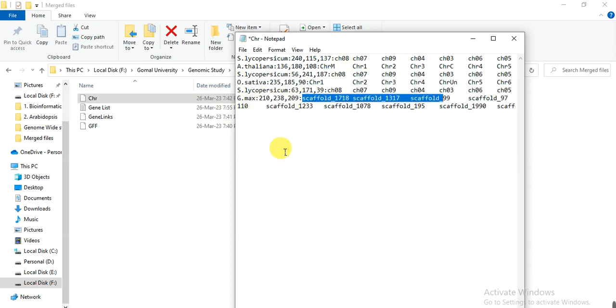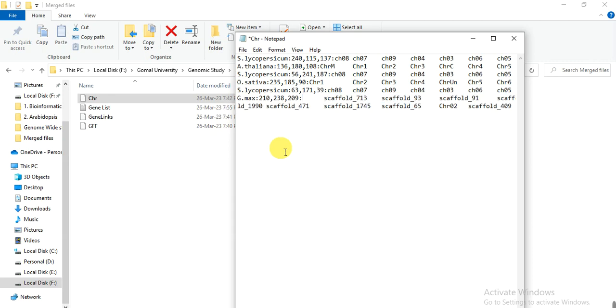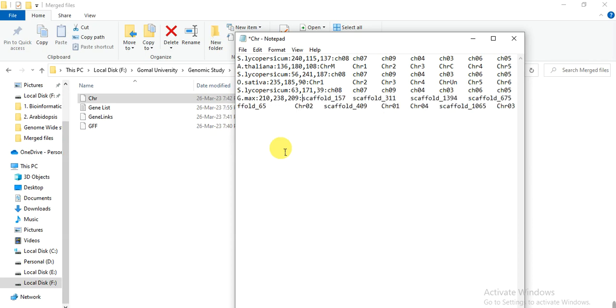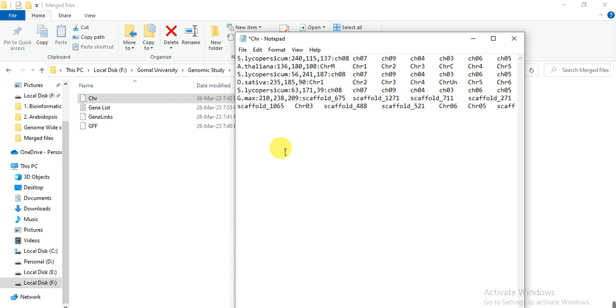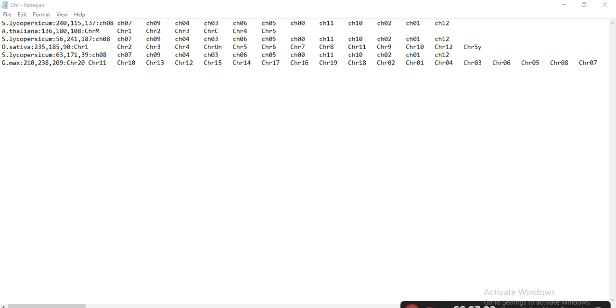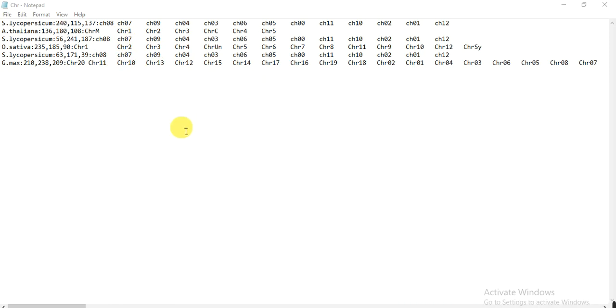We don't need scaffolds. So after deleting the unwanted scaffolds, we only have the chromosomes of each organism. But remember that to delete from the GFF file also.